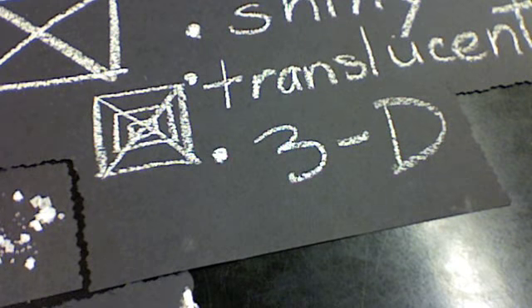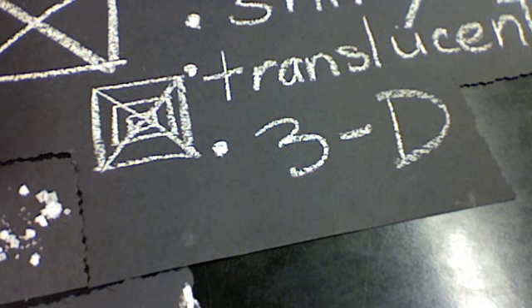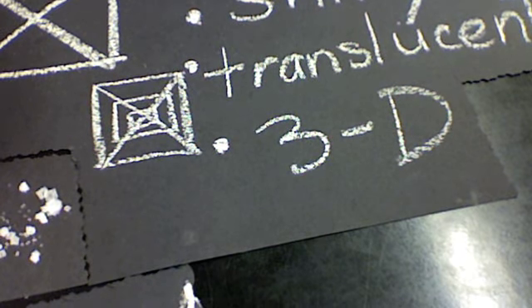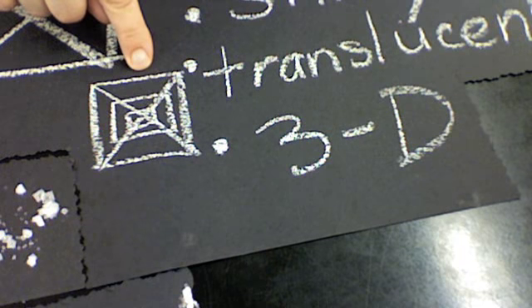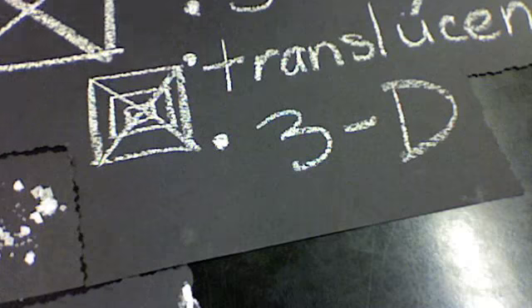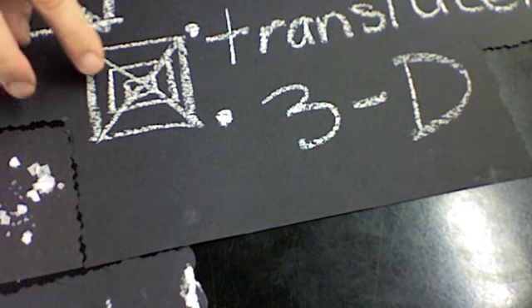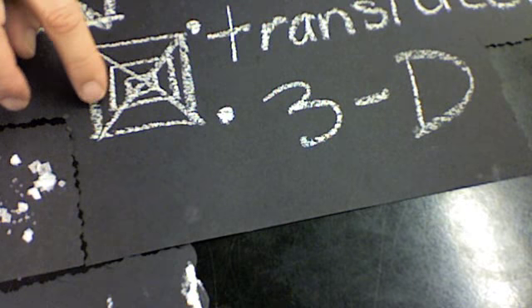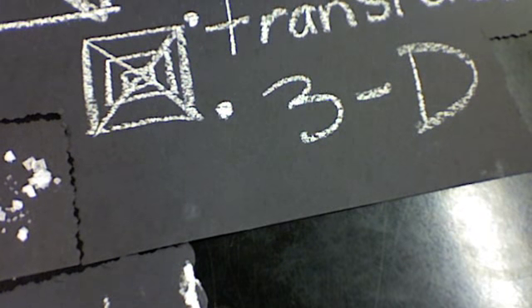And anytime you see something with that shape and pattern, even if you didn't make the solution and evaporate the water yourself, you can automatically know it's a sodium chloride crystal. Exactly. Some crystals of sodium chloride got really fancy. They had 3 dimensions to them. They looked as if they were stacked on top of each other, and that's what we're trying to show here. But even if they were crystals of salt piled up on each other, they were all still square and they all had X's in them. So square is an important word to have in your notebook to describe this.